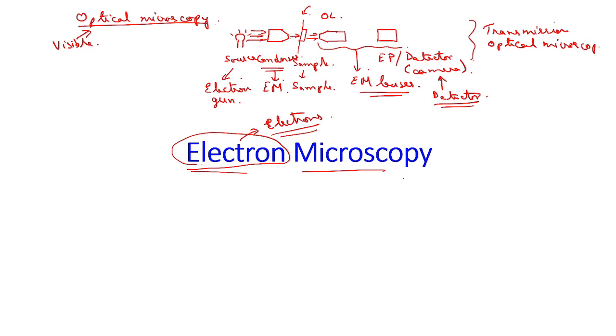However, the similar arrangement in the case of electron microscopy is regarded as TEM. So TEM is basically the transmission electron microscope.